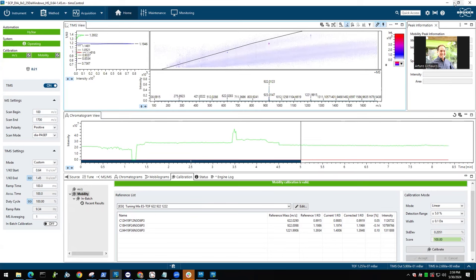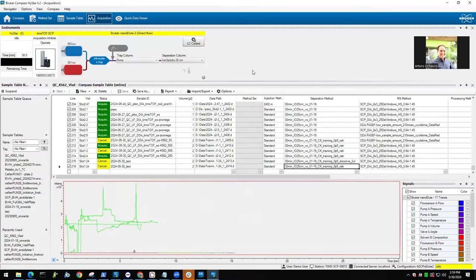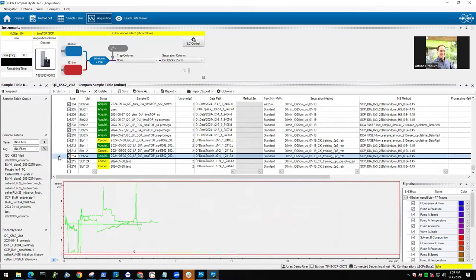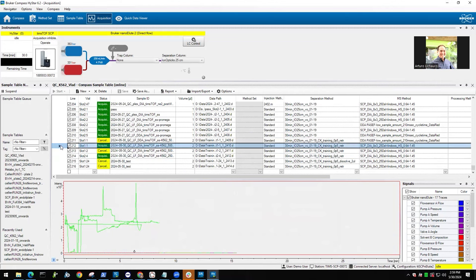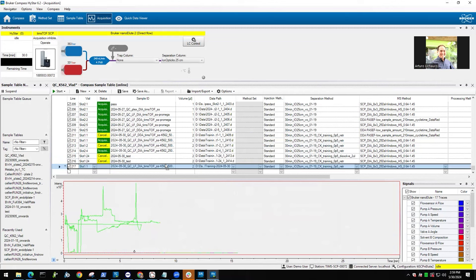Right, so this is now done. And now we are actually ready to write our queue. And I'm a bit lazy, so I just copy something from above. Earlier we did the experiment. We had two microliters in the plate, or in one vial position, and we wanted to make sure that the two microliters were actually injected. So it's 250 picograms, but we injected two microliters, so it's actually 500 picograms.